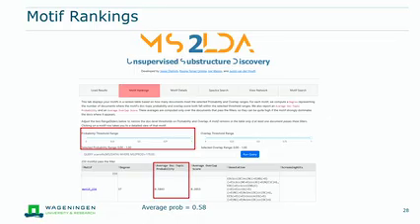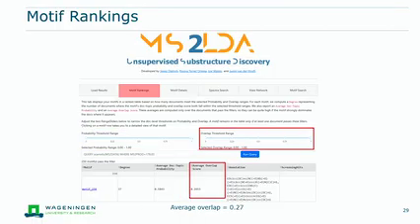On the top there's a slider, so you can also adjust the thresholds if you have, I don't know, 1,000 master motifs generated and you only want to look at a few of them. You can set that with the slider threshold. I would encourage you to not go too low, because you can see already, I know this is a good motif with an average score of 0.58. Even more so with the average overlap score. The average overlap score describes, if you compare the fragments and losses of the master motif with all the 37 spectra, how high is the overlap. And here it's even lower, but you can certainly set a threshold there as well, maybe to 0.1.